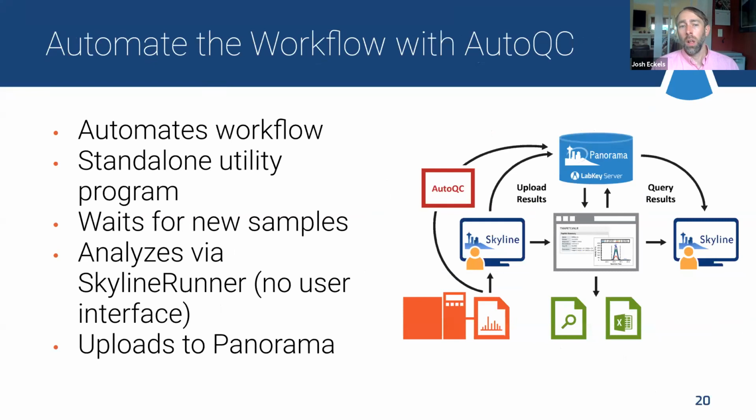And then we want to make this as automated as possible, right? No one really wants to spend all their time doing system suitability. You want to be analyzing your actual data, but you want to have confidence that your results are reliable. And so AutoQC, like Lindsay said, really takes that drudgery out of the workflow.